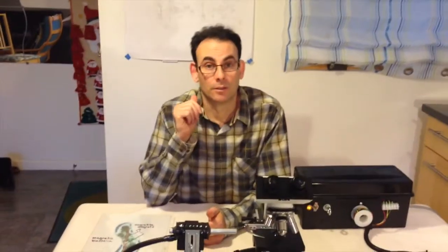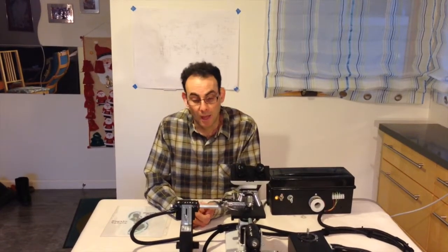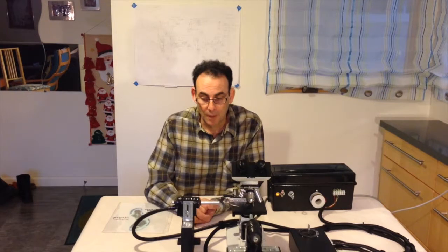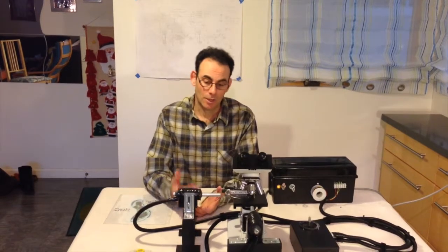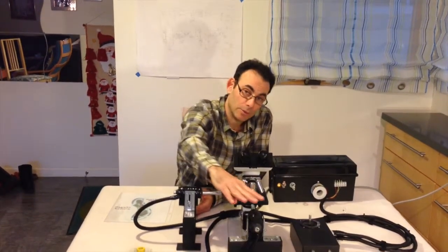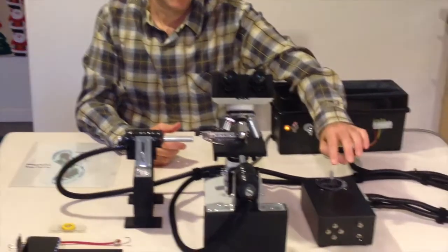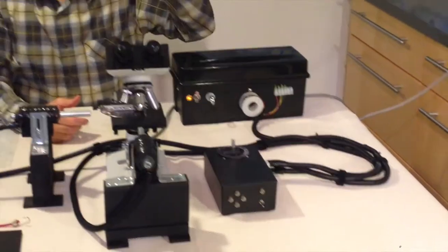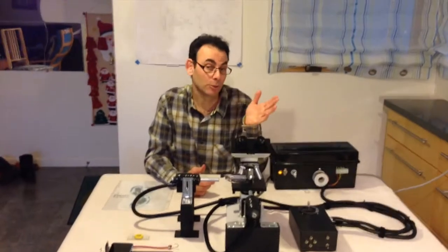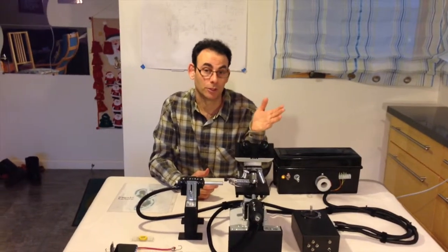We're going to exploit that by providing a magnetic field that is not Earth's magnetic field. We're going to make our own electromagnetic fields produced in these coils that can be controlled with this joystick. We've got a joystick here that can change not only the amplitude of the magnetic field, but the direction of the magnetic field.